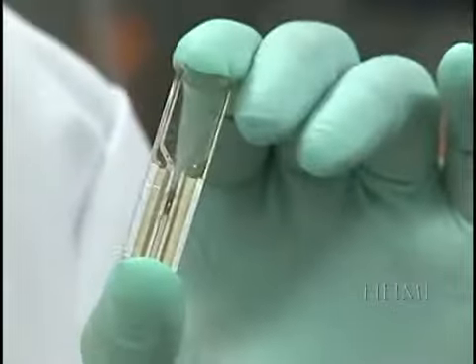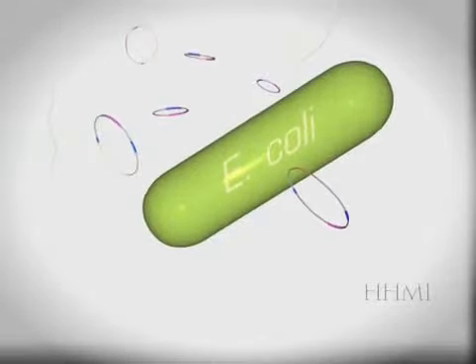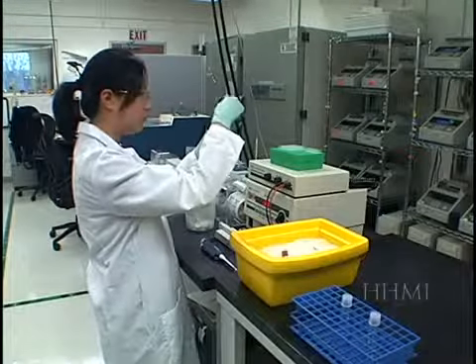This cuvette contains a mix of plasmids in a solution with E. coli bacteria. Plasmids can get into bacteria on their own. However, we want this process to happen quickly. We want an even distribution of 1 plasmid containing 1 DNA fragment per bacterium. To do this, we put the bacteria and plasmid solution in an electroporator. This machine does what it sounds like.